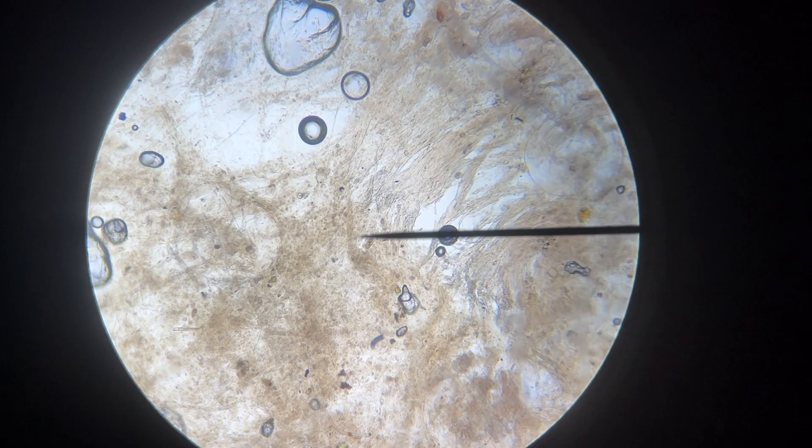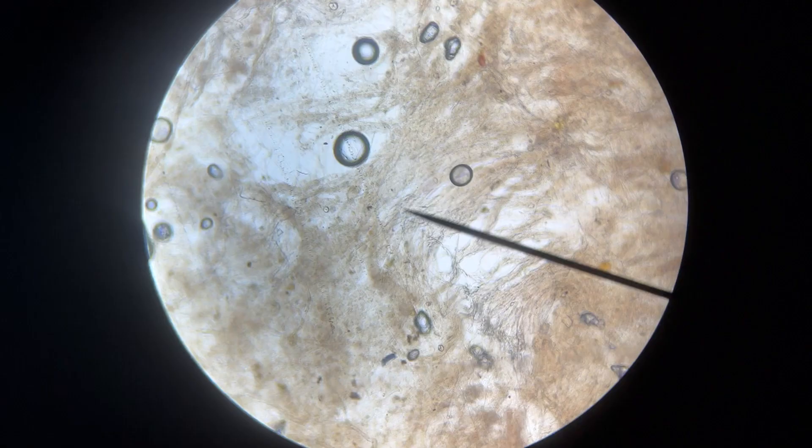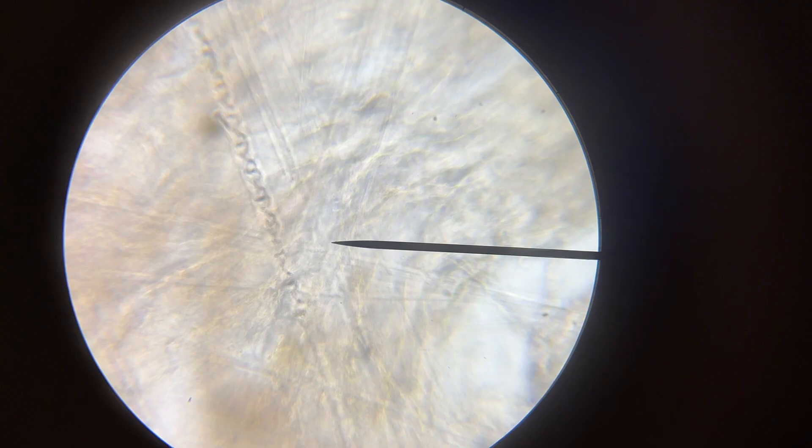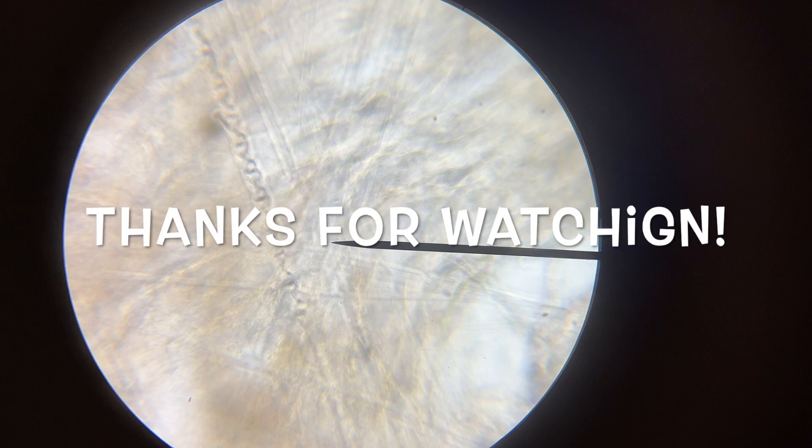Just for fun, I took some of the DNA and put it under a microscope, so here you can see some of the images that I got from doing this. There you go!